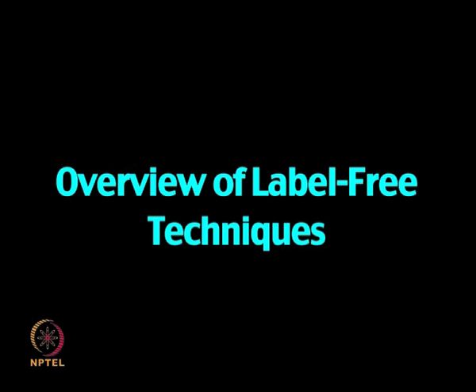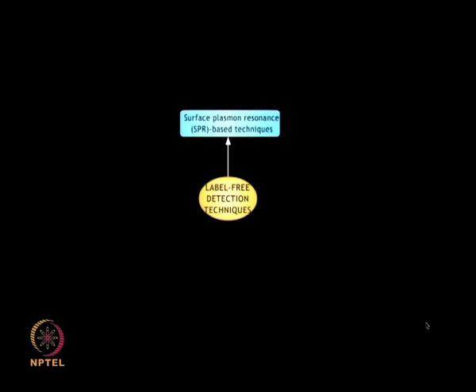They do not involve laborious procedure, but have their own pitfalls such as sensitivity and specificity issues.